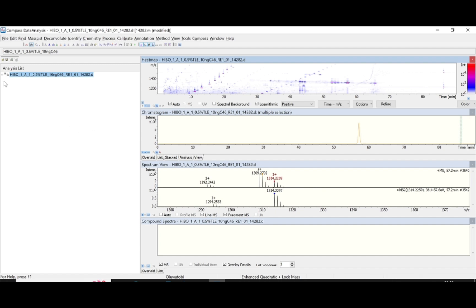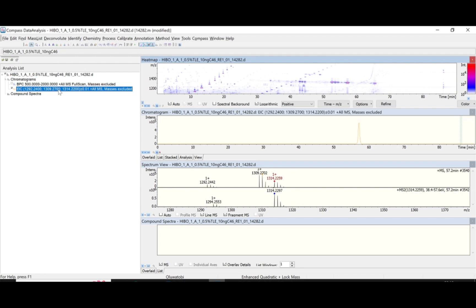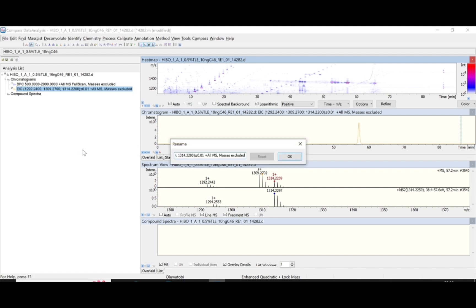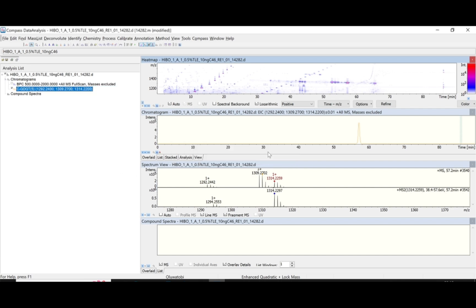The next thing I do is rename the compound. I click on it and go to Rename. The name is GDGT-5 — you can also use GDGT or GDGT5. I click OK and the name updates accordingly.